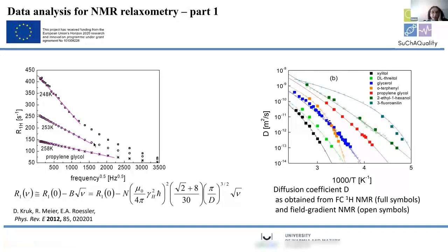You can ask how long. I would say as long as the resonance frequency times the correlation time is much smaller than 1, because mathematically it stems from the so-called Taylor expansion of the Fourier transform of the correlation function. However, if you observe such an effect, it means that the motion is isotropic. And one can straightforwardly determine the translational diffusion coefficient from the low frequency slope.